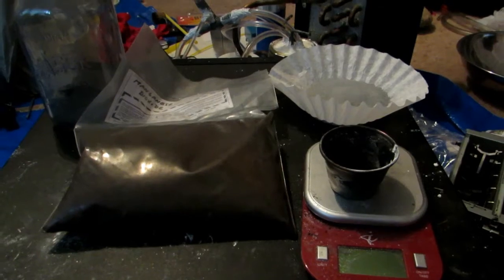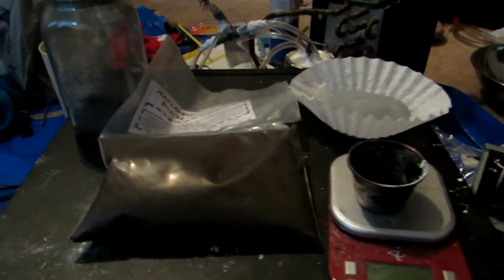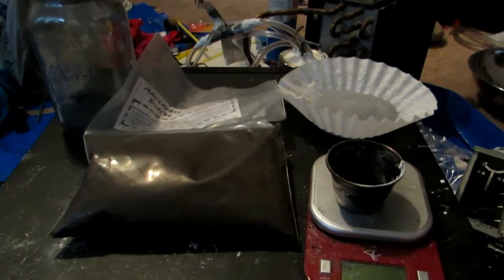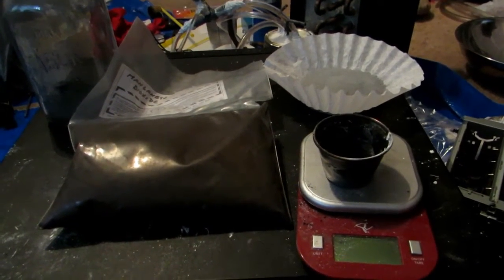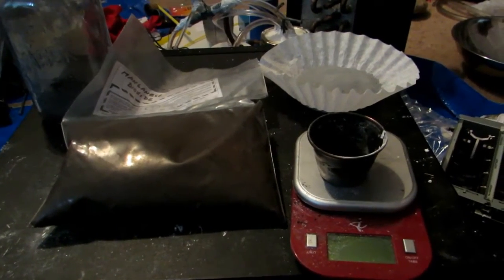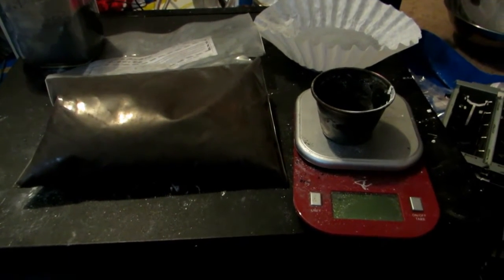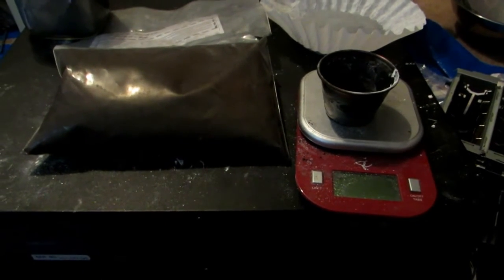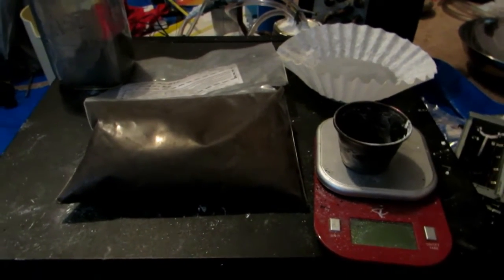In a previous video, which I will take down soon, I made manganese metal through a thermite reaction between aluminum powder and manganese dioxide. However, this was not the best result because it was such a very energetic reaction due to the very fine particles of aluminum that all my manganese metal practically burnt away, leaving us with a very small piece of manganese metal. It was magnetic because it had alloyed with the iron, and it just didn't go very well.